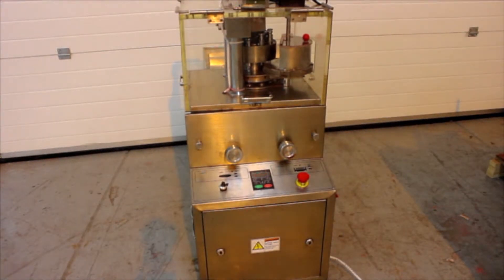When fitted with a 5 pin turret, this model is able to produce 9,000 tablets per hour. When fitted with a 7 pin turret, this model is able to produce 12,000 tablets per hour. When fitted with a 9 head turret, the RTP 9 is able to produce 16,000 tablets per hour.